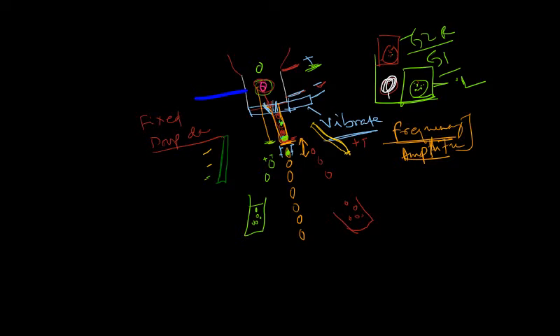The stream stays neutral. It applies a positive charge, then neutralizes by negative charge, further applies a negative charge, then the second cell is deflected, then it applies a positive charge and the stream is neutral. And when the stream is neutral, that means the droplets that are generated are also not carrying any net charge, and they will not be deflected by the external voltage plate. So they would go to the waste. This is how the separation happens. So this is detection, then here it is deflection, then here it is collection.